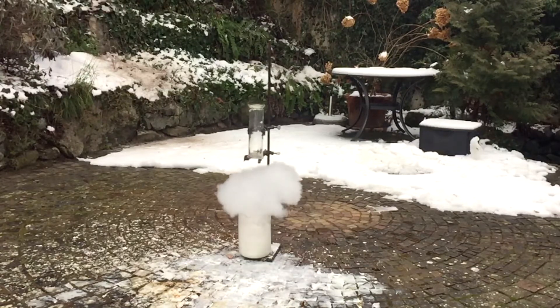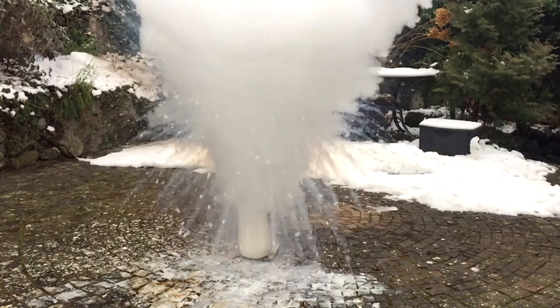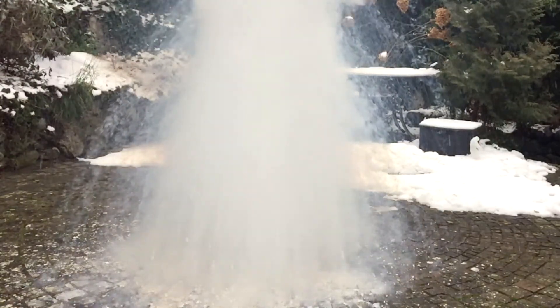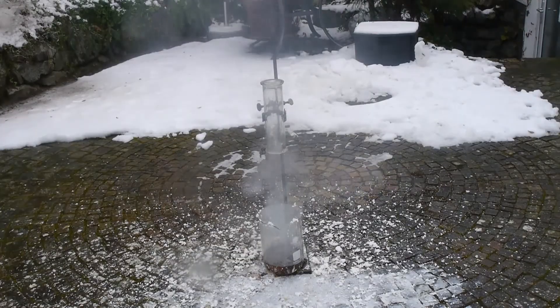That was absolutely insane. I hope it's not going to get way worse with the sodium hydroxide in solution. Quite a while later, this is still fuming profusely.